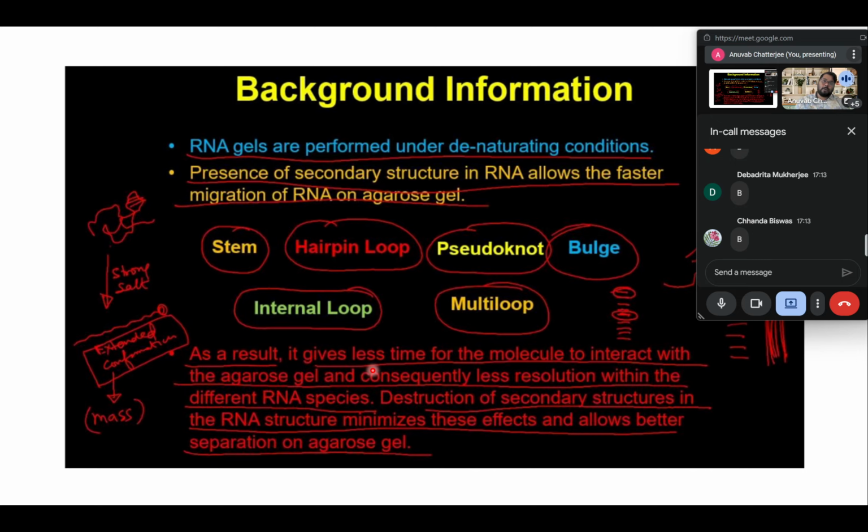Then you have something known as a nicked plasmid, which has one of the strands or both of the strands broken, which travels way slower. And then you have a supercoiled structure where the plasmid, instead of forming a ring-like structure, loops and loops, forms a very tightly woven ball that travels very fast through the gel. So the same plasmid will give you three different bands, and then you are confused which is your actual size of the plasmid because you do not know.